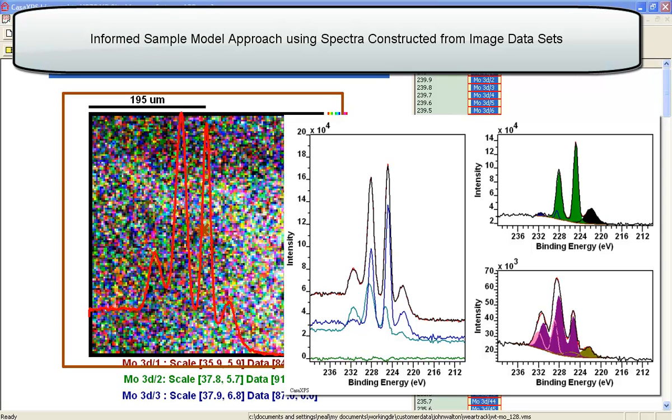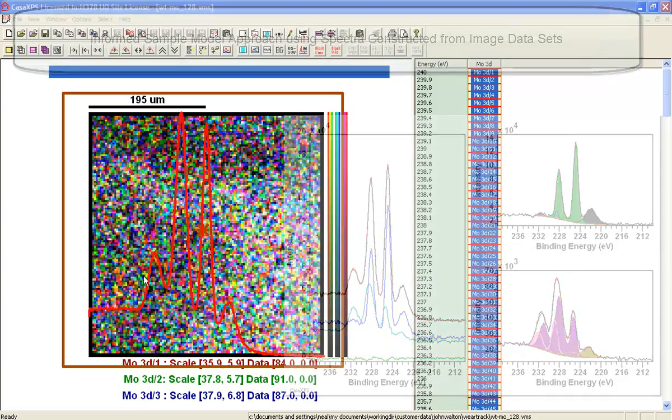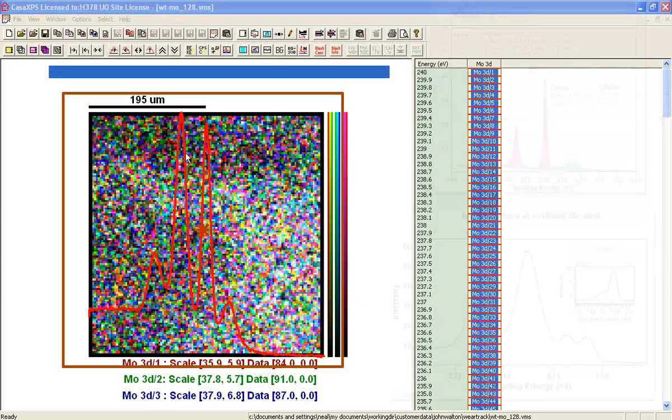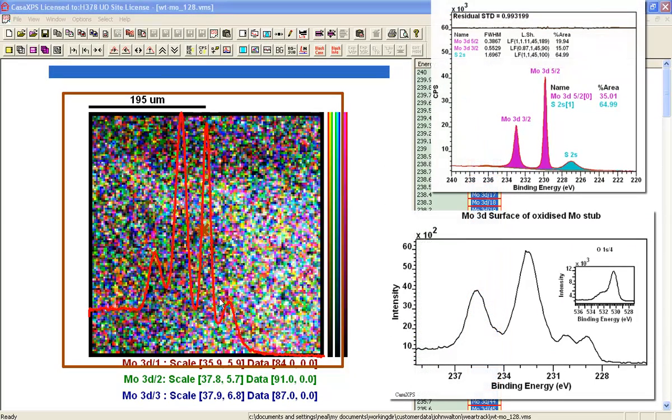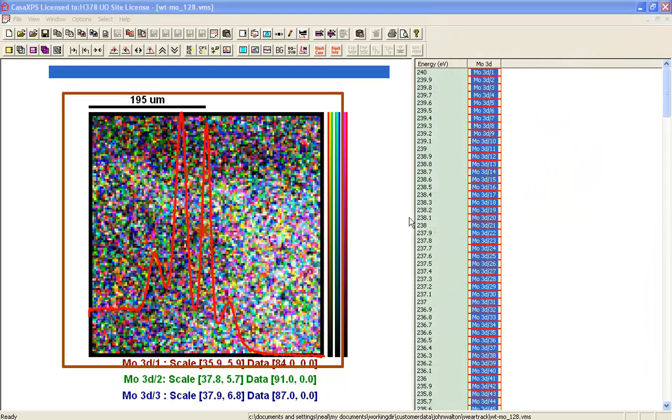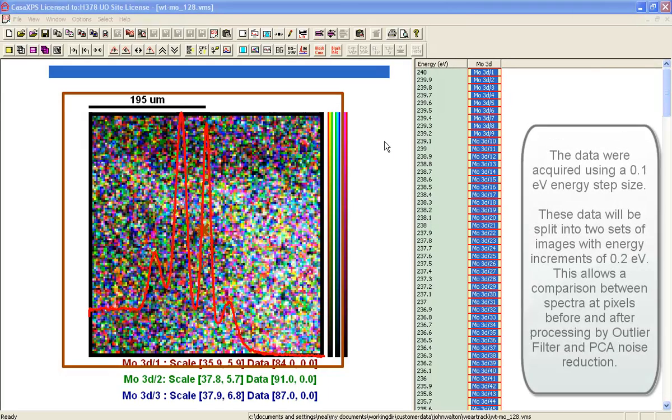The objective in this analysis is to take a stack of images that clearly contain a very nice structure from a molybdenum 3D and sulfur 2S and use these to help analyze the peak composition that lies beneath such a complex envelope as this. So we'll begin.